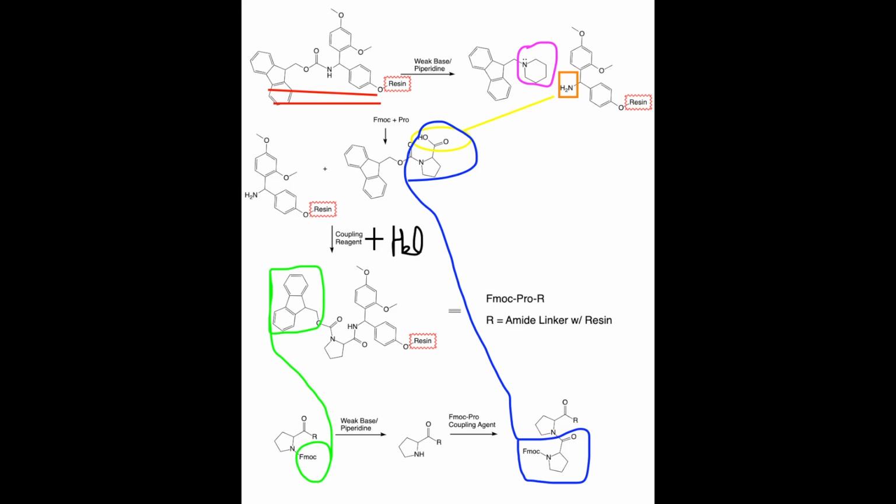And I also circled in green the FMOC protecting group, and from after this point I just label it as the FMOC protecting group. So you can see the resin actually had its own FMOC protecting group, and the FMOC itself interacts with the piperidine. They make a complex which then washes away, and then you can have a deprotected amine so that it can attack the next amino acid that you add.